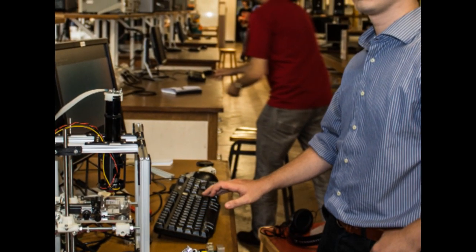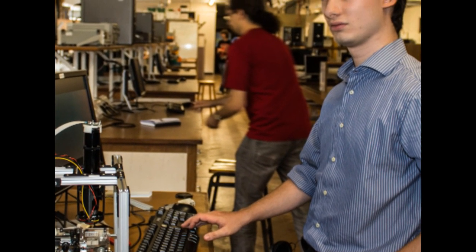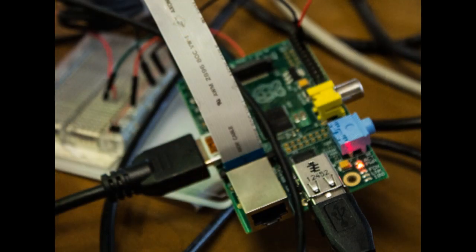In the lab, Marco Selvi, a third-year physics student at Cambridge, showed me the prototype and the automatic tasks it can perform thanks to the Raspberry Pi at its heart.